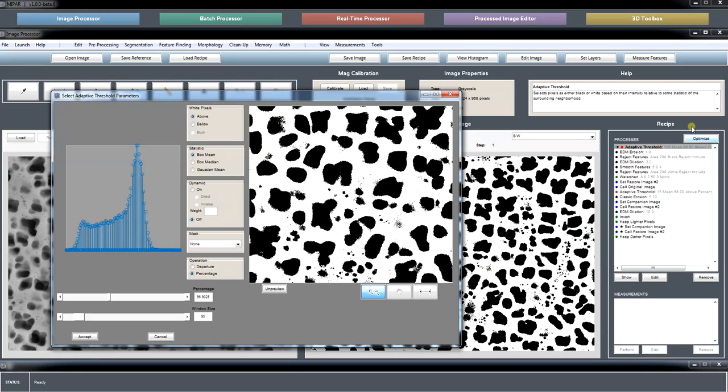What this optimization function or tool lets you do is develop more objective, rules-based recipes that are free from user bias, so that even though all of your segmentations are not necessarily perfect, and that in and of itself is an ill-defined concept because you're only ever comparing a segmentation to the image rather than the actual microstructure, which is always an unknown, and the image is always a convolution of the microscope with the microstructure.